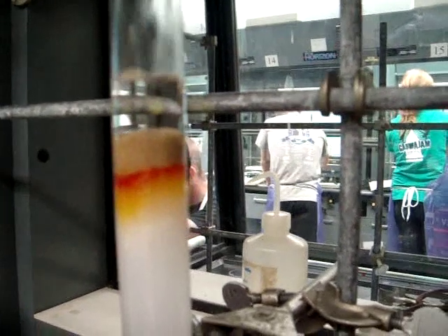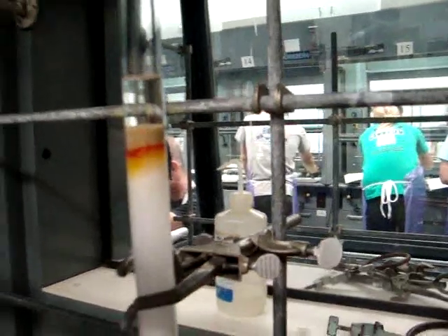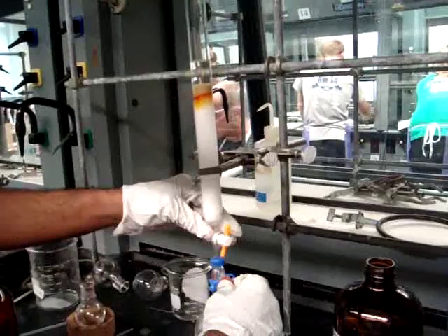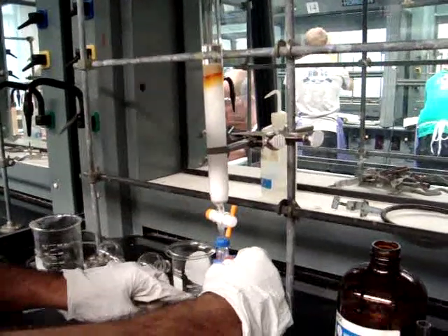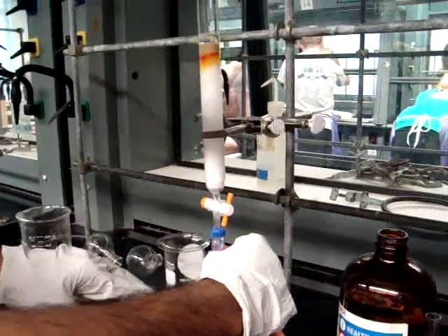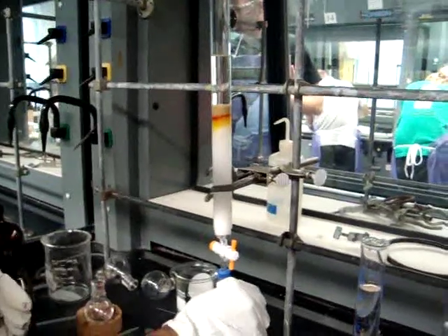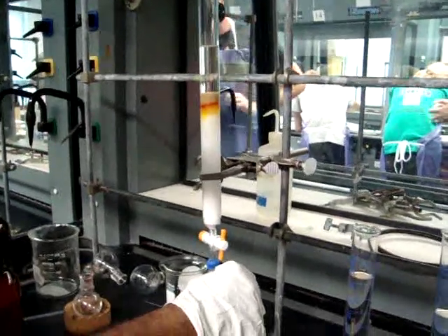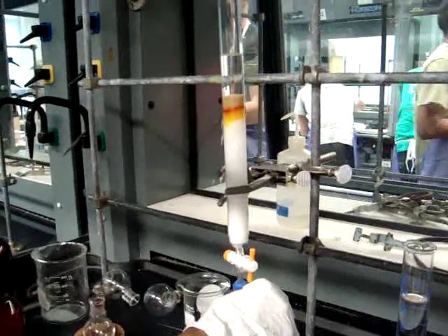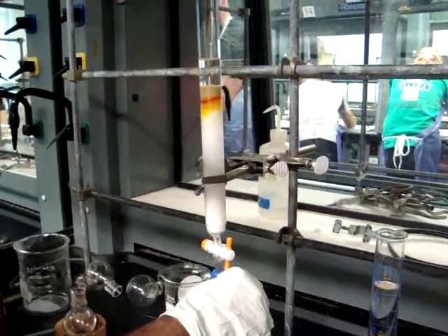Then add ten more milliliters of pet ether very carefully to the column. Again, attach the vacuum and allow this to drain into the flask. This will pack down the column completely. Continue to add and drain pet ether from the column until about 25 milliliters of solvent has been added. You will have about 20 milliliters of pet ether drained from the column.